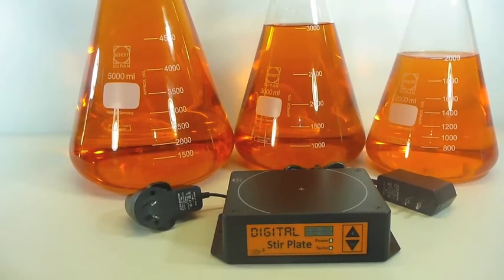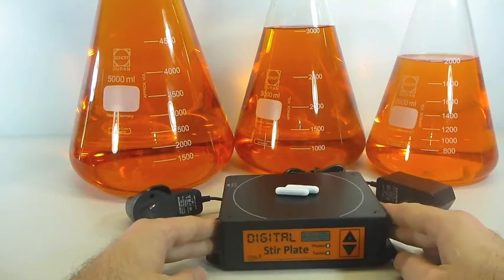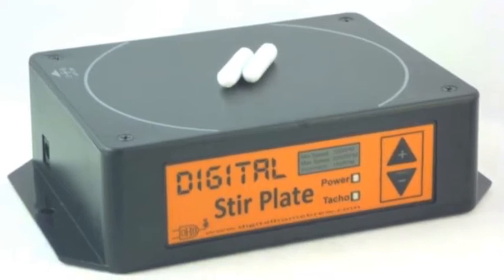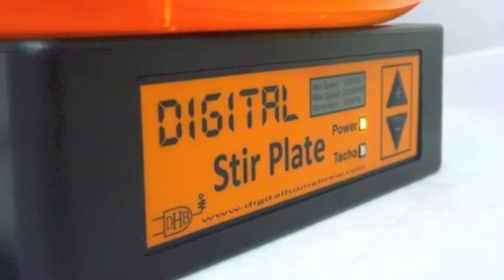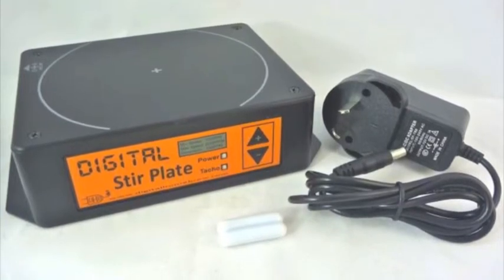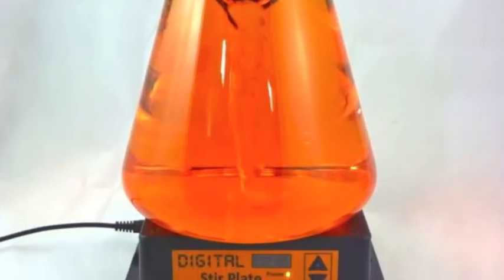Although the digital stir plate has some awesome technical wizardry going on under the cover, and even though it's designed and assembled right here in Australia, I believe you'll still find that our digital stir plate is priced at or below any of the comparable competing products out there — even the imported stuff from China — and we're really proud of this. So you're getting a quality, professional, Australian-made stir plate from real people offering a real warranty. If anything goes wrong, we really want to know about it and we want to help you fix the issue. And that's all for $79.